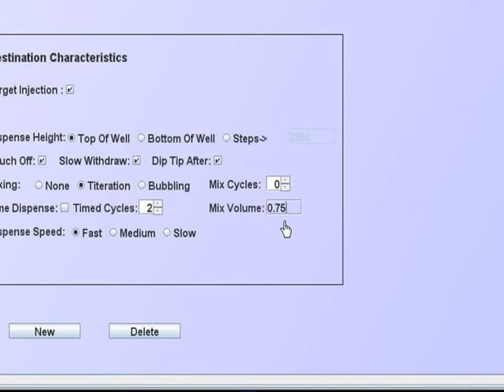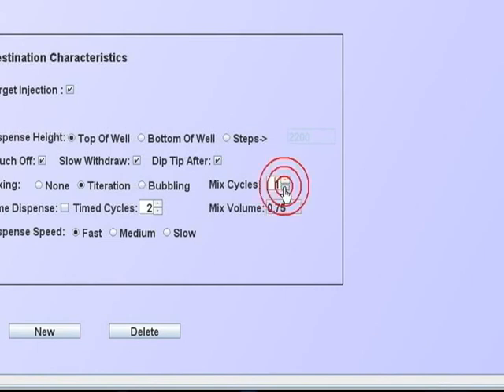As an alternative, a set number may be entered. The number of mix cycles is self-explanatory. Six cycles is better than three. Six takes twice as long as three.